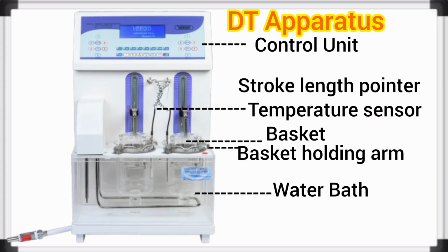DT apparatus having control unit, stroke length pointer, temperature sensor, basket, basket holding arm, water bath.